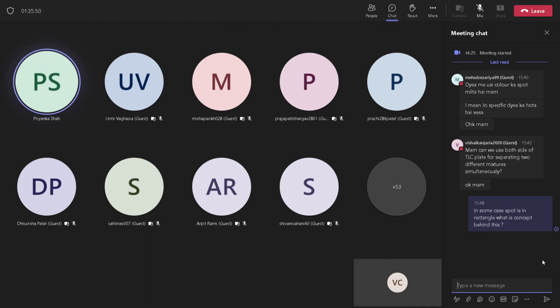वो आपने डिफरेंस देखा होगा कि हाउ द शेप ऑफ स्पॉट इन TLC एंड HPTLC. ओके, आप चाहो तो HPTLC का वीडियो you can see on YouTube कि हाउ वो इस तरीके से कैपिलरी से रेक्टेंगुलर शेप में उसका स्पॉटिंग होता है. बट इन TLC वी जनरली डू राउंड स्पॉट्स बिकॉज हम मैन्युअली एक कैपिलरी लेके सिंपली करते हैं. बट दिस इज द कंप्लीट ऑटोमेटेड वर्जन, इंस्ट्रूमेंटल वर्जन ऑफ TLC.